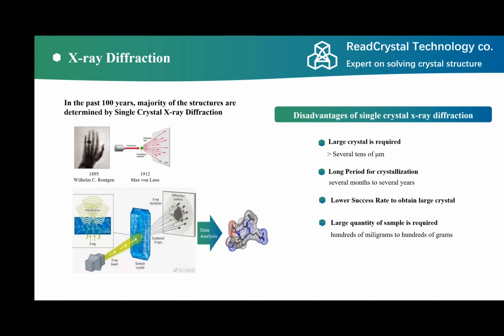So this means a large amount of sample is needed, maybe hundreds of milligrams, and those proteins are quite precious.